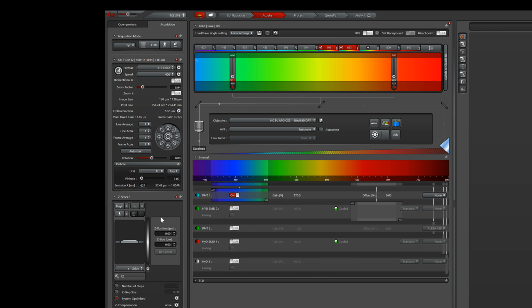Finally, besides directly from the display of the DMI-8, you can also access the objective lenses through the software. However, please use this drop-down only as a reminder of the objectives and their immersion media, as those are not explicitly stated on the microscope display.